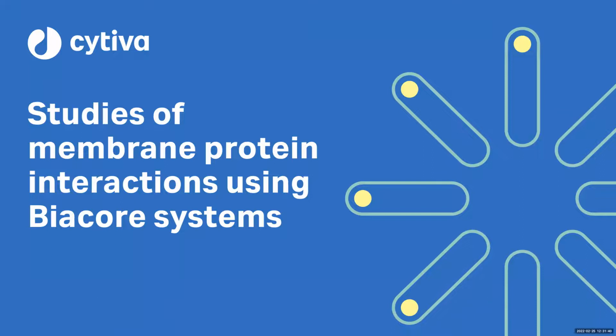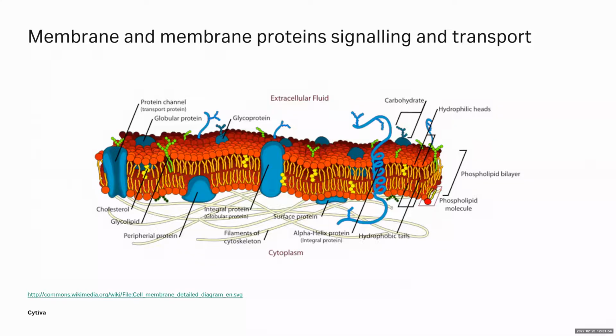Okay, so now we'll move from a fairly well-defined small molecule protein binding system to a series of more complex interactions with membrane proteins. Membrane proteins are usually, for most biological purposes, more difficult to work with because you have a relatively small population of target proteins in a membrane environment, mixed together. You have a variety of different proteins in this membrane environment. It's difficult to purify them out. It can be done, but it usually takes a significant amount of work.